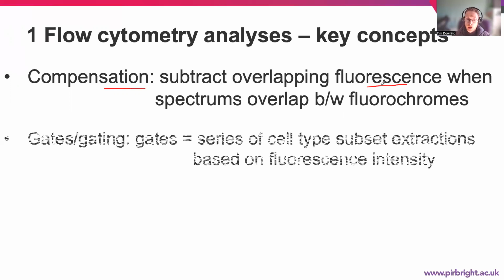This links to using gates or gating. So gates are a series of cell type subset extractions based on the fluorescence intensity. So you might plot them against each other and identify cells that are of interest.